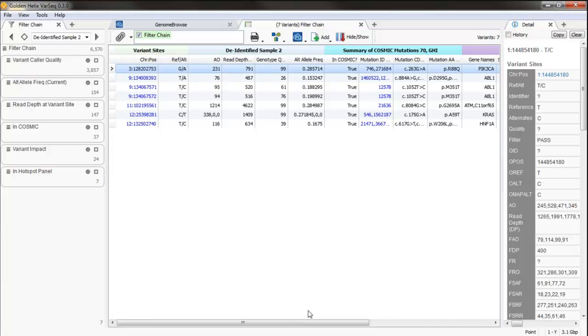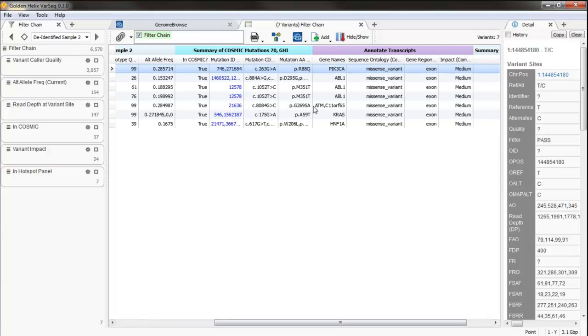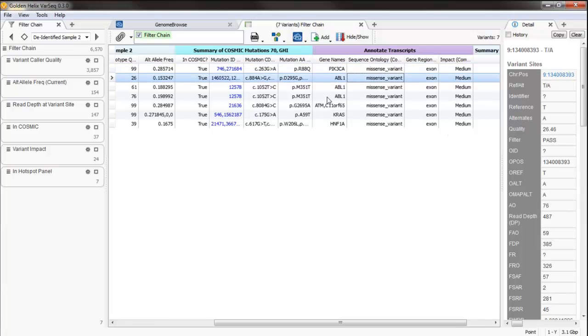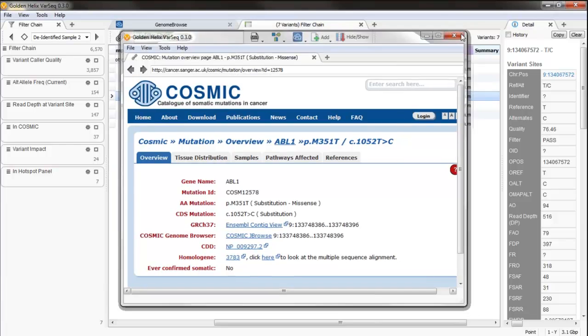And this table is already focused to just give me a couple columns out of the total set that I could for these annotations. I have COSMIC and gene annotations. So I have everything I need here to start documenting the evidence for my analysis. I have details of the current variant. I have data about what gene they're in, the types of mutations, information about COSMIC. You can drill down by clicking on any of these contextual links, etc.